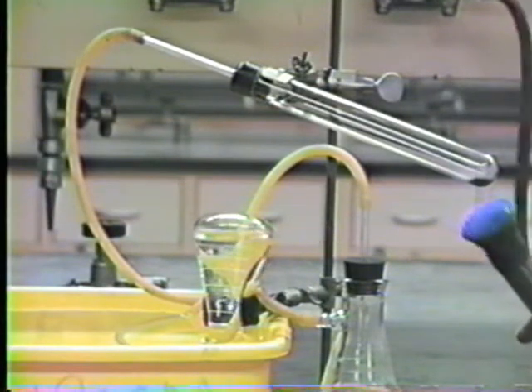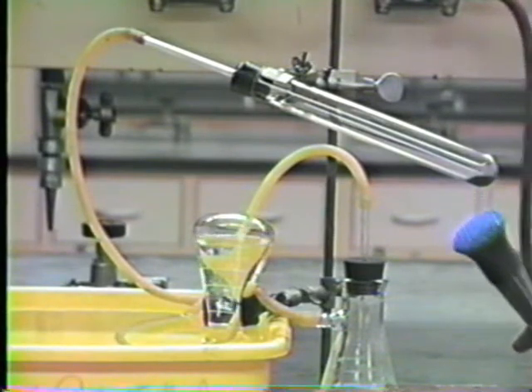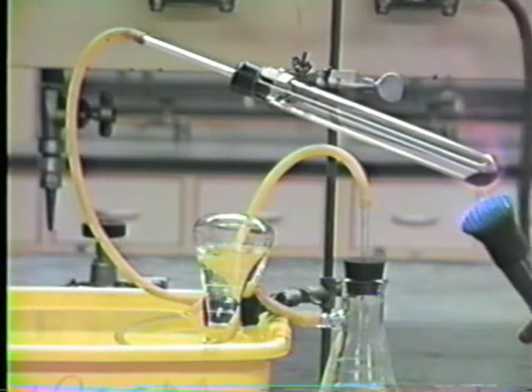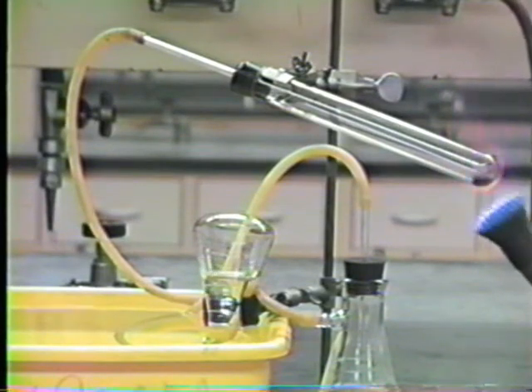There we go. Now we're really generating the oxygen at a reasonably rapid rate. All that water that had originally gone into the rubber tube is now being blown out by the oxygen which is generated here. And here we go.